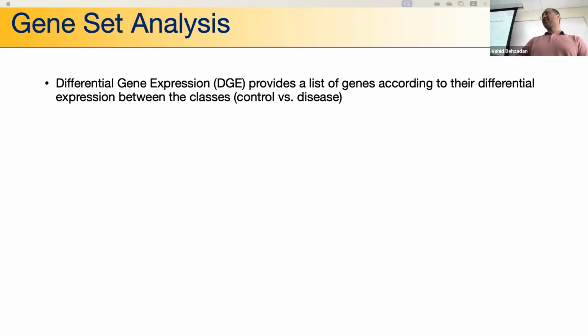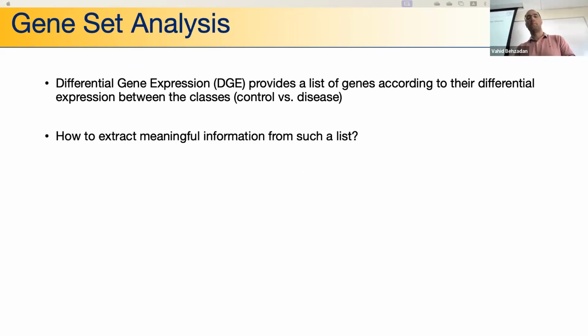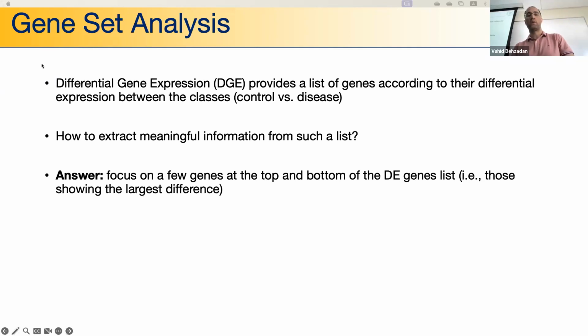However, doing differential gene expression is not always informative, because after correction for multiple testing, you might end up with 0 differentiable genes. And sometimes, when you get these differential genes, they are not meaningful, and you cannot conclude their differences and/or their functional differences between the conditions. So you want to do something called gene set analysis.